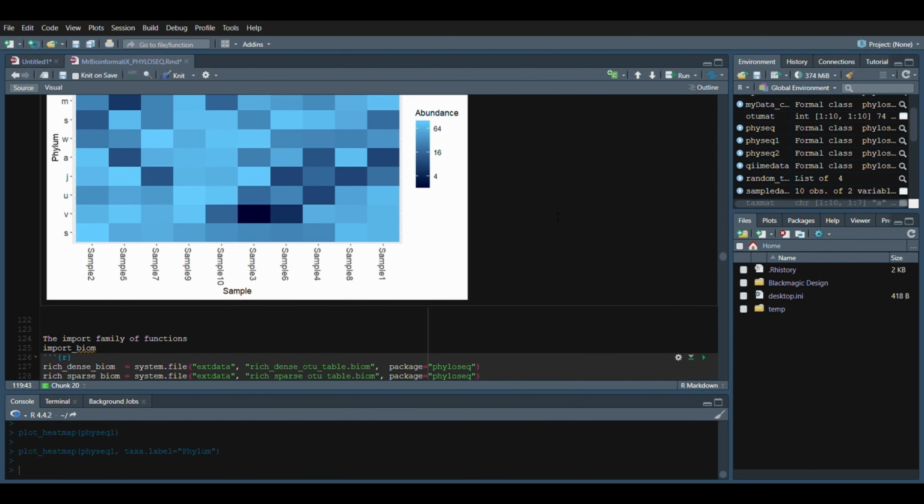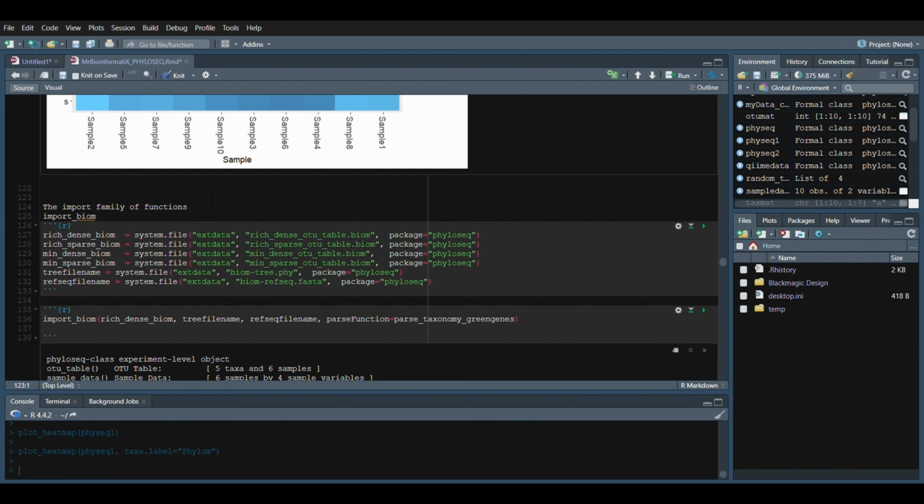And now, what if we want to import microbial community datasets into R for our analysis? In this case, we can use the microbio me QIIME function from the phyloseq package. This function was designed to interface with the QIIME database, which previously contained numerous microbial datasets. However, it's important to note that the QIIME database is currently down indefinitely, so this function is now primarily for reference purposes. The phyloseq package provides the capability to import various types of biom files seamlessly.